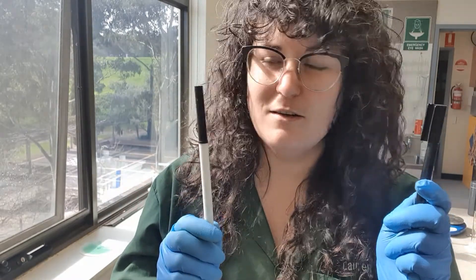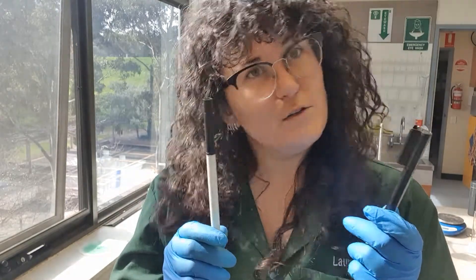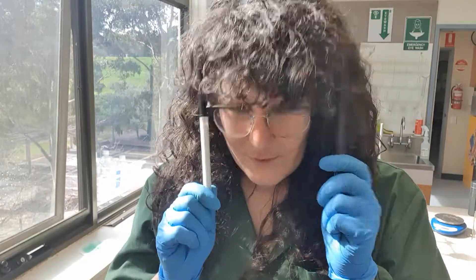How many colors do you think make up a black texta? Do you think it's just black, or do you think there's more to it? Let's find out!